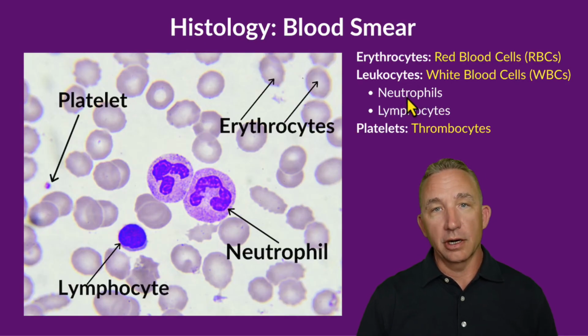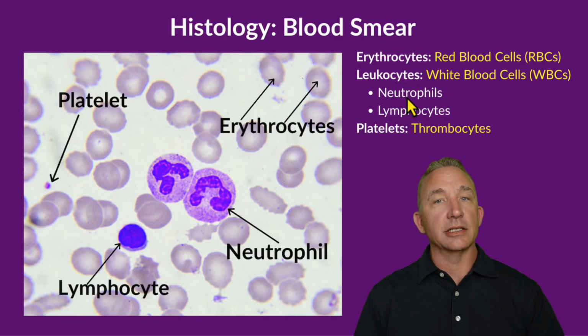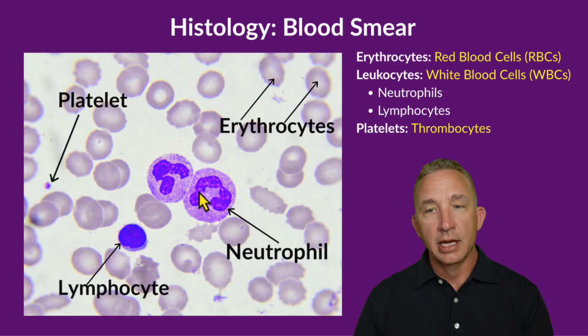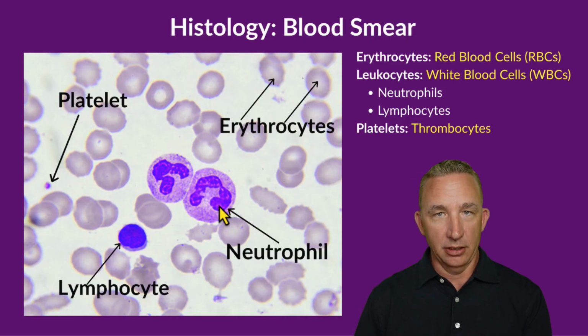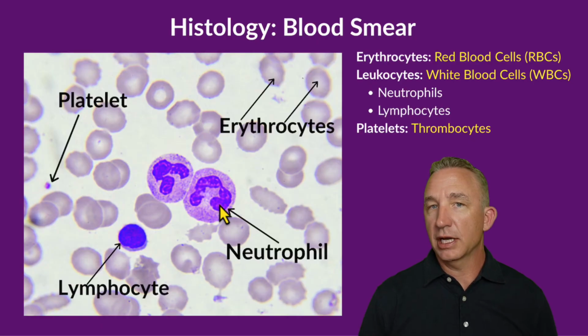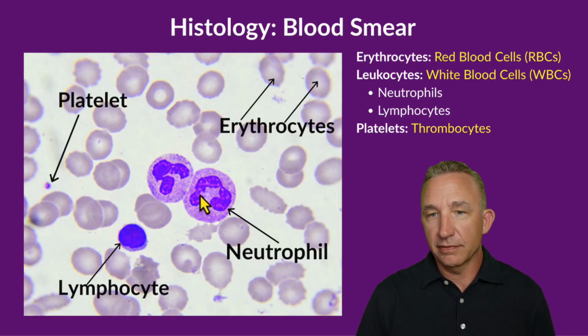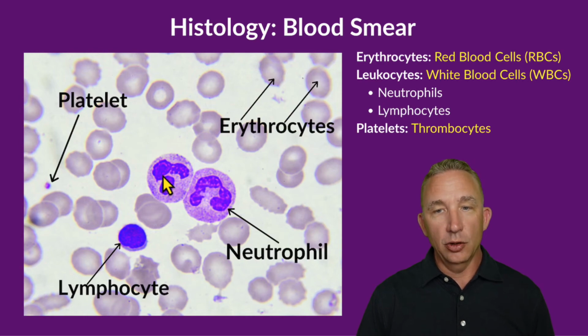Neutrophils are considered our first responders, which makes sense because there are more of them when it comes to leukocytes. So when we see these structurally, what happens is the nucleus gets contorted. All of the darker section in here, the nucleus as it's stained dark, is contorted and almost looks like there are lobes to it. So I can differentiate the actual cell based on its structural appearance. They'll look different, but I look for that lobed appearance of how the nucleus was contorted.